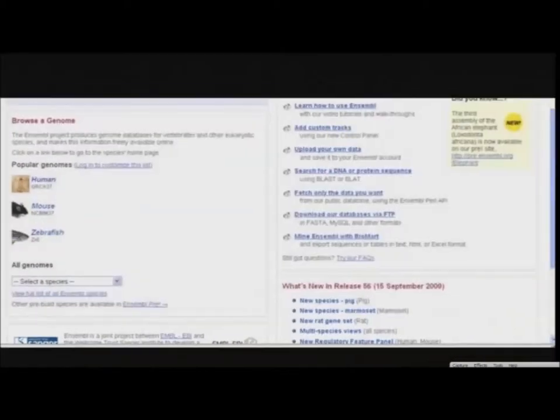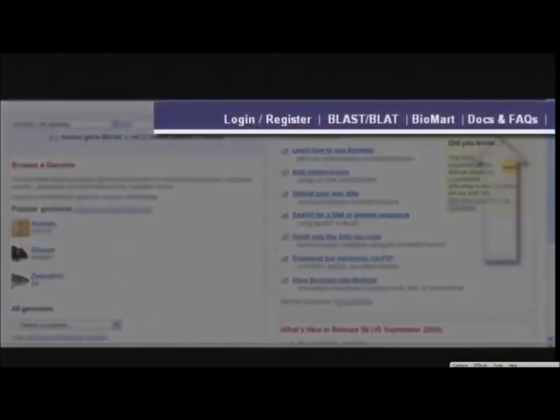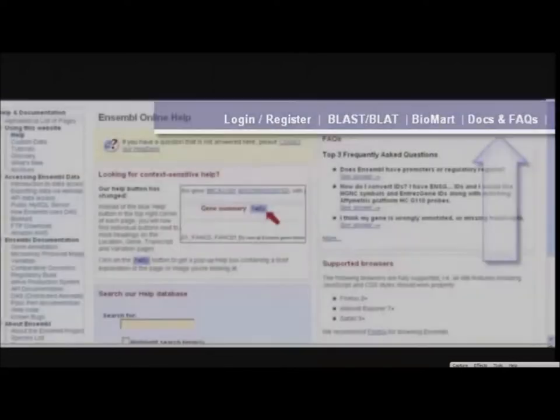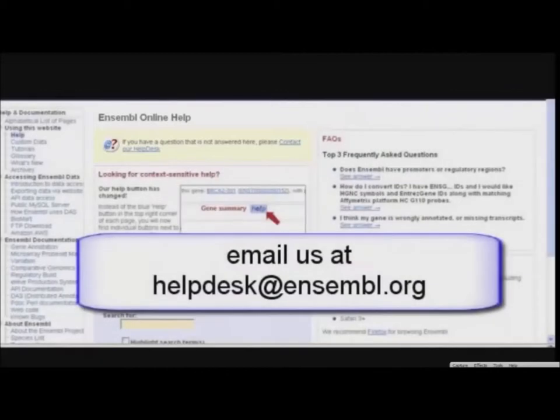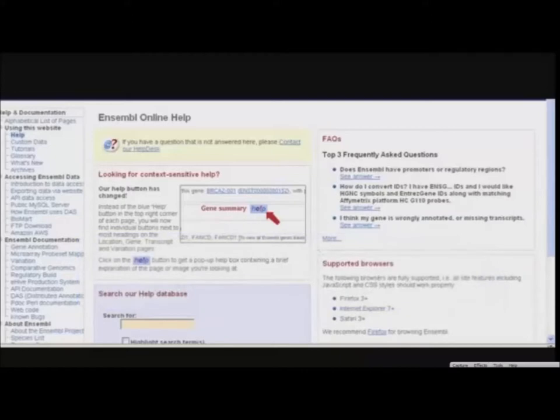An archive link is present at the bottom of every page. This allows older versions of Ensembl to be accessed. At the top, find links to documentation and frequently asked questions. Contact our Help Desk with any questions or comments using the link shown here. Help Desk messages are replied to within 48 hours, so please make use of this resource.